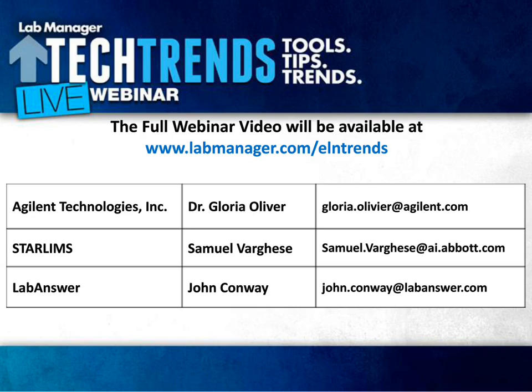Okay, thank you. Sam or John? Yeah, I know from Lab Answers' perspective, we're involved in dozens of compliance and regulatory validations around LIMS, ELNs, and LISs. So from our vantage point, it all seems a big green go. I don't see anything holding that back.